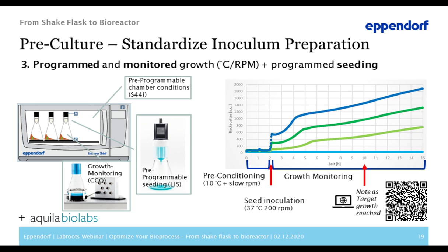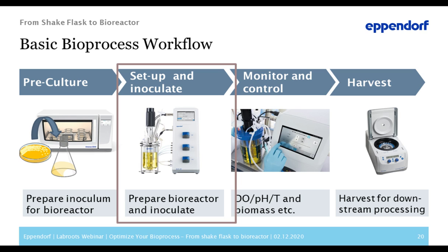I see most of you, as you see also hopefully as well, work with benchtop reactors, and also many don't work with bioreactors yet. And some work with large production. Yeah, good mixture, but benchtop is the winner, I think. Okay, and now the pre-culture is ready for inoculation, but I think, David, we have to set up the bioreactor first, so I keep it cooled a bit more. Exactly. It takes a little bit more before we can start with the real bioprocess with the bioreactor.